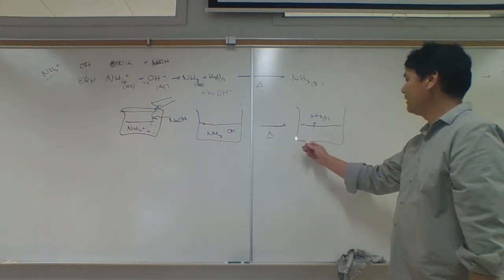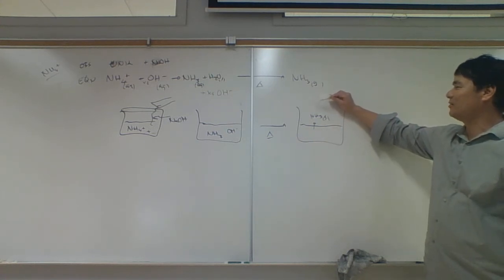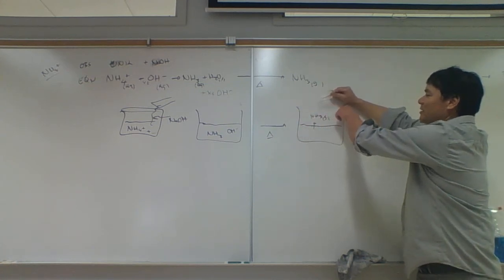But this is red. And so what I'm going to do is I'm just going to hold this, or actually I don't have to hold it. I'll just lay it on top of the beaker. If I lay it on top of the beaker, it'll provide somewhat of a seal.